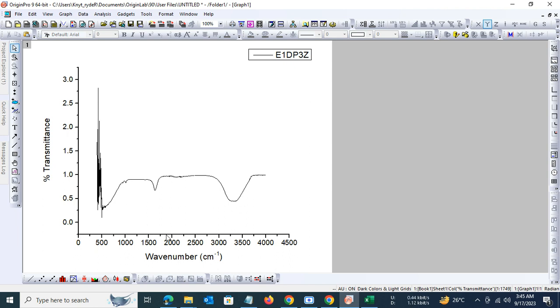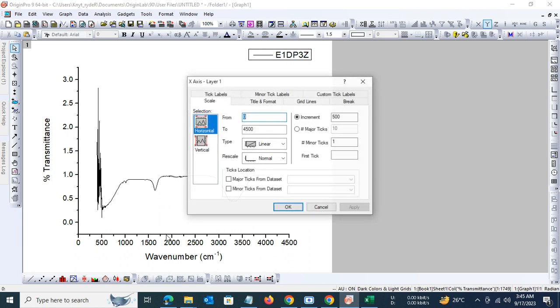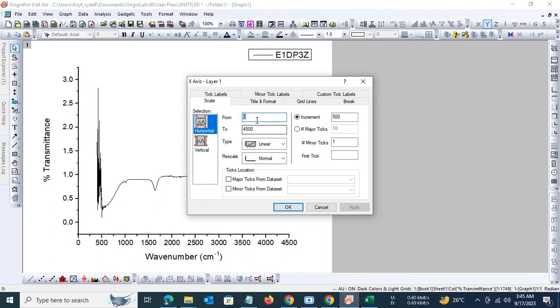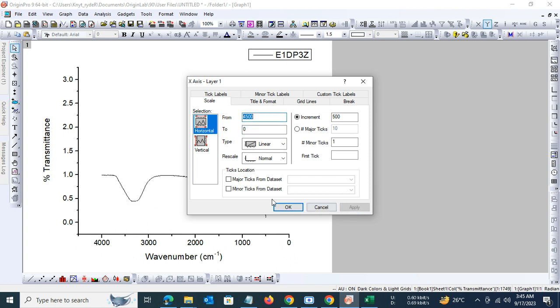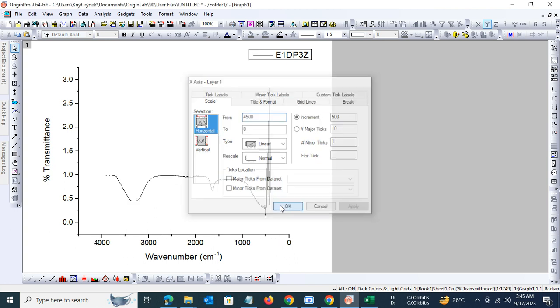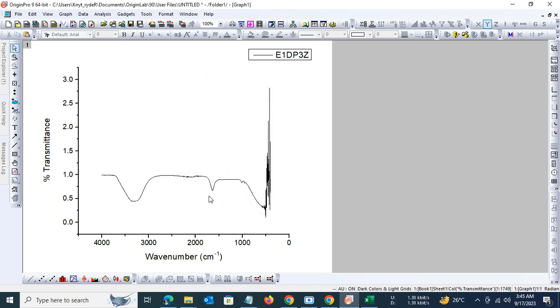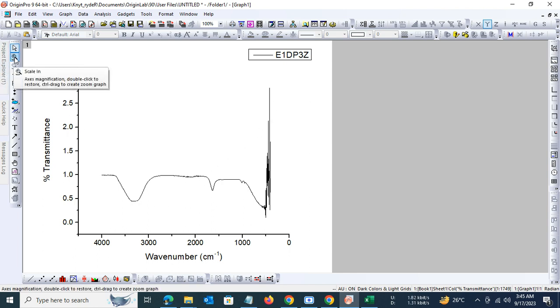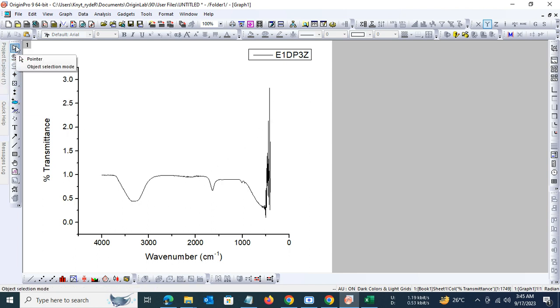In fact, it should be opposite, so let us change it. We will set the from point as 4500 and it will go up to zero. Click on apply. Now in order to get a better grasp of the spectra, we will adjust the y-axis.